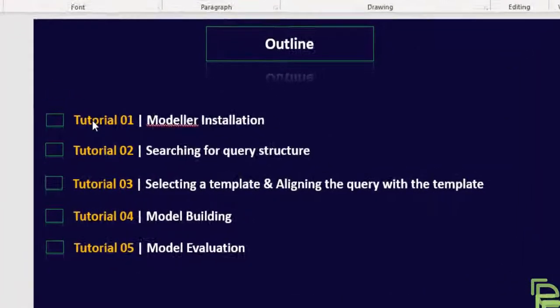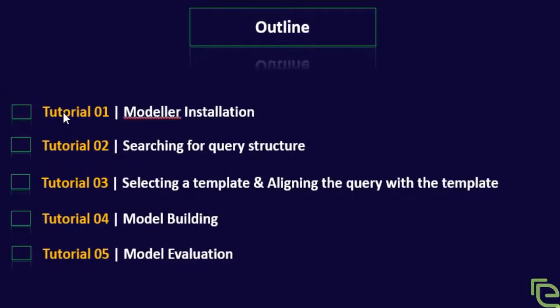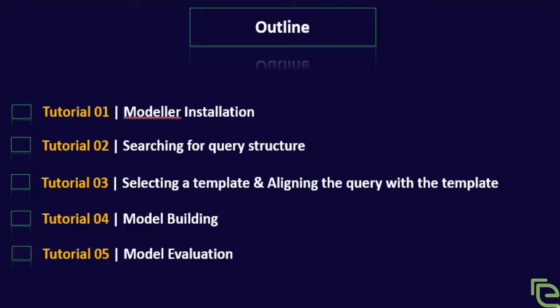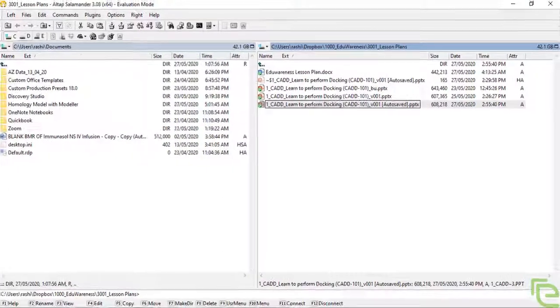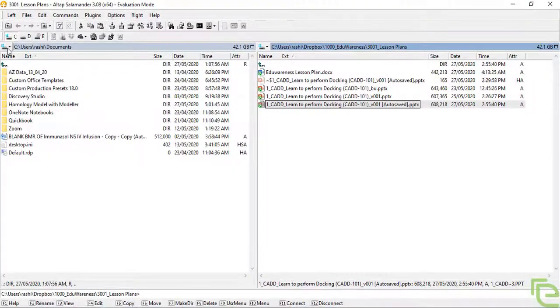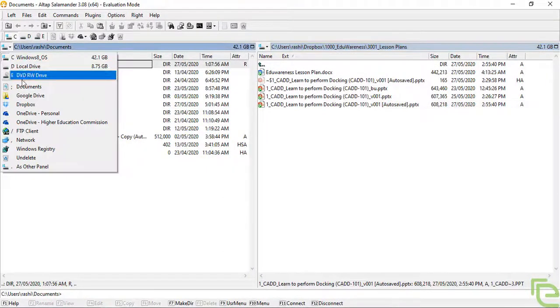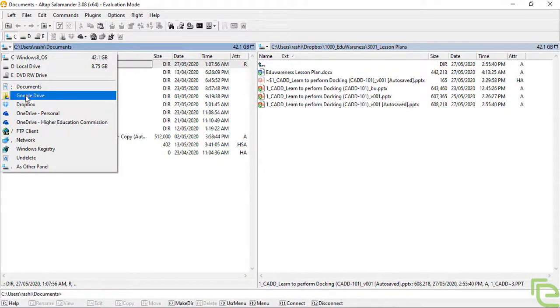Hello everyone, I hope all of you are doing well. Today we will follow Tutorial 3: selecting a template and aligning the query with the template.